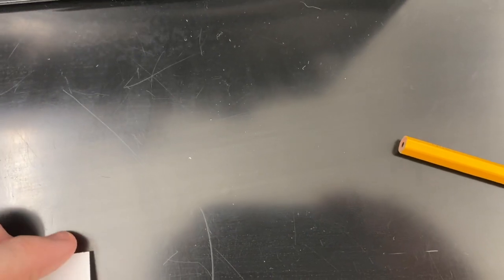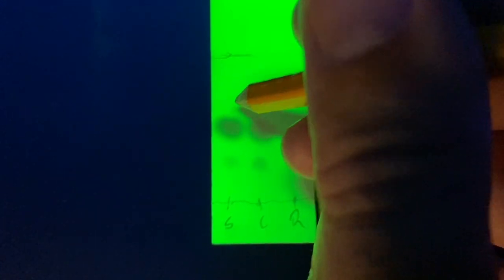After the TLC plate's developed, you can see I put a line where the solvent made up to. There's really nothing to see, but if you put it under a UV light, you will see that the spots that correspond to the various compounds will show up on the TLC paper. So now you can see if the reaction has been completed or not. So I'll let you determine if it has. To be able to see the spots after you take it out from underneath the UV lamp, you will circle the spots with a pencil.